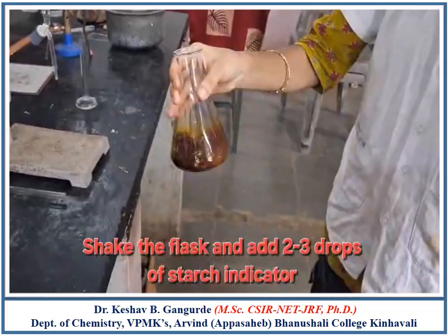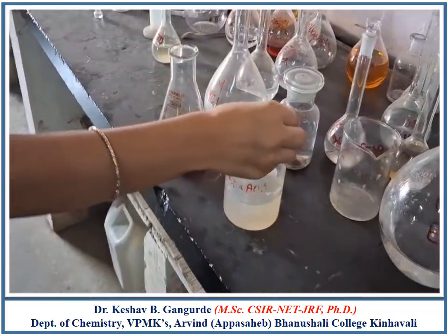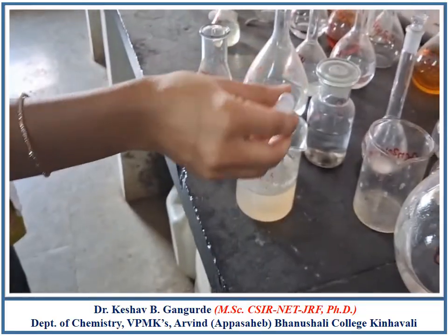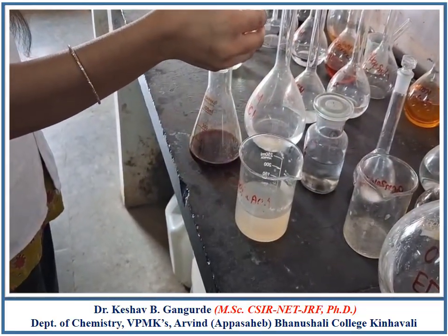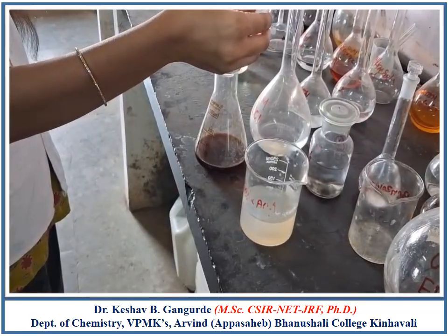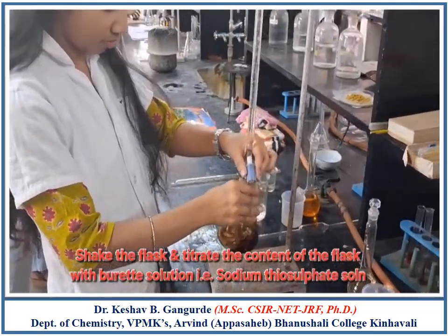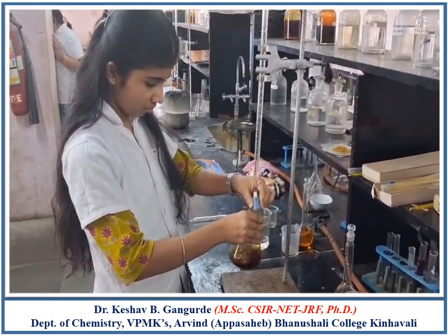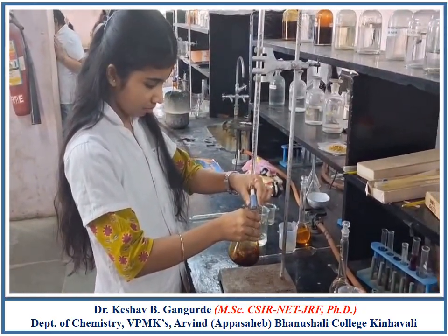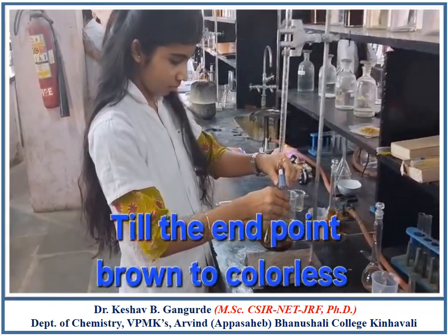Shake the flask. Add 2 to 3 drops of starch indicator to the reaction mixture. Shake the flask and titrate the content of the flask with burette solution, that is standardized 0.1 normal sodium thiosulphate solution, till the end point brown to colorless.